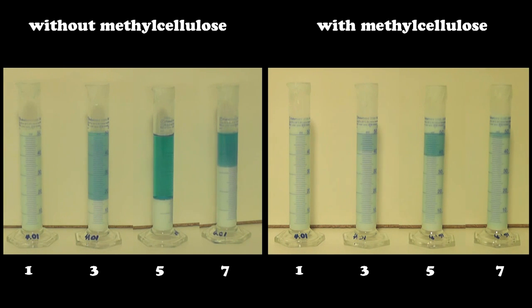This means that the water in these suspensions is much more resistant to particles moving through it, causing the sedimentation rate to be much slower. This can be clearly seen by comparing the sedimentation rates of these suspensions with their otherwise identical counterparts on the left.